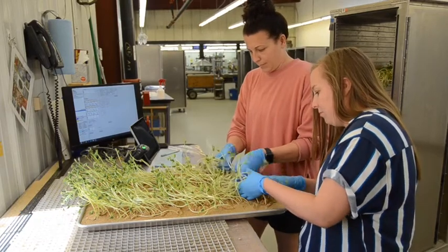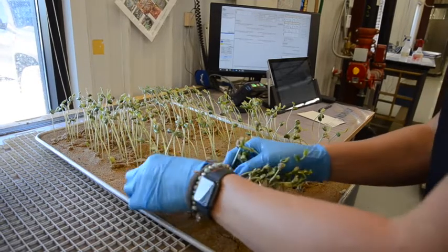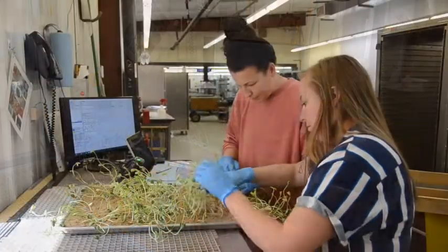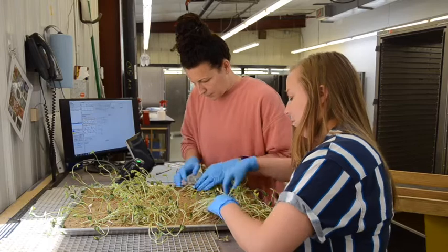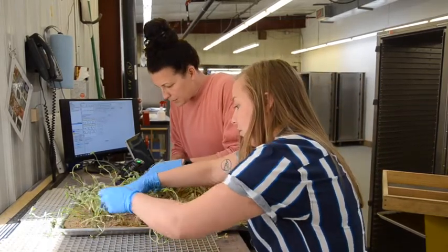Here we're forward counting the normal seedlings. We tug on each seedling to verify that the roots are securely anchored into the crepe cellulose paper that's covered with sand. We also document any abnormalities that we identify in the sample, including any fungal issues.